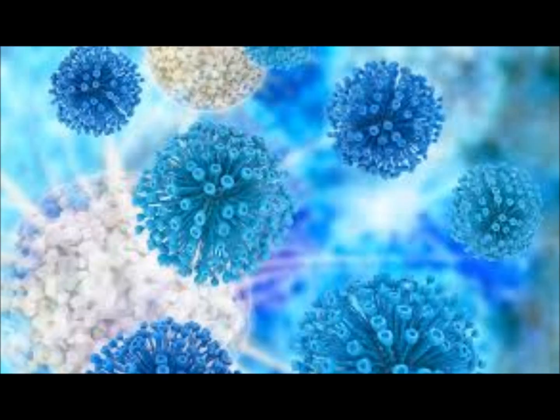So for you as an inexperienced tech to say, well, I think those are all white cells, when you go to 10, they seem so far away. This is the hardest piece of clinical gram stains, I feel, is judging your cells only on 10. So first you've got to go to oil and find them. Then you've got to put them in your center and go back to 10. Then you've got to look for everything else in the field. And the field seems really big when you go back to 10. I feel to this day that's still very hard when you don't do them day in, day out. Okay? So don't get discouraged.